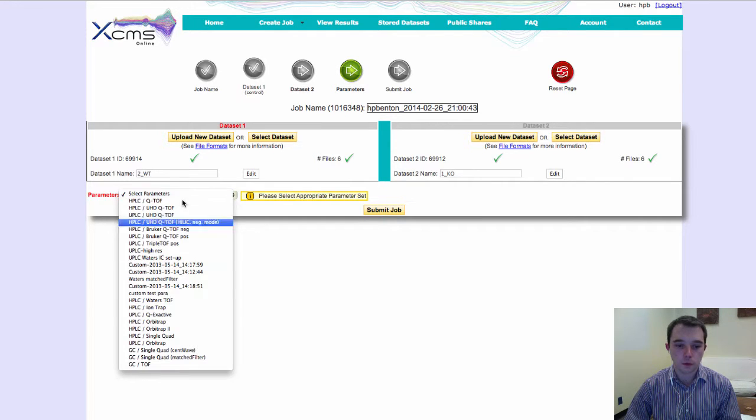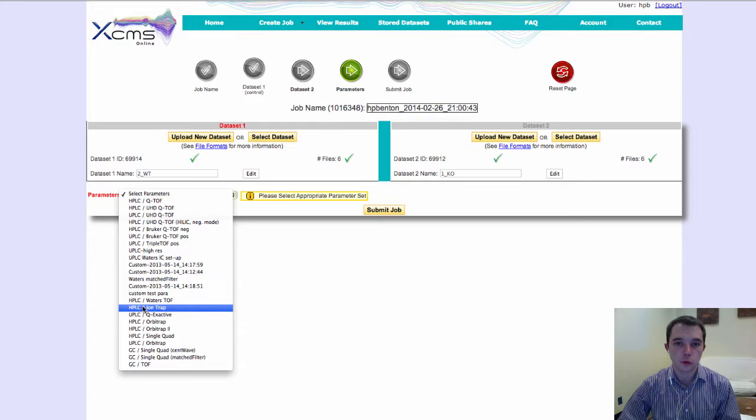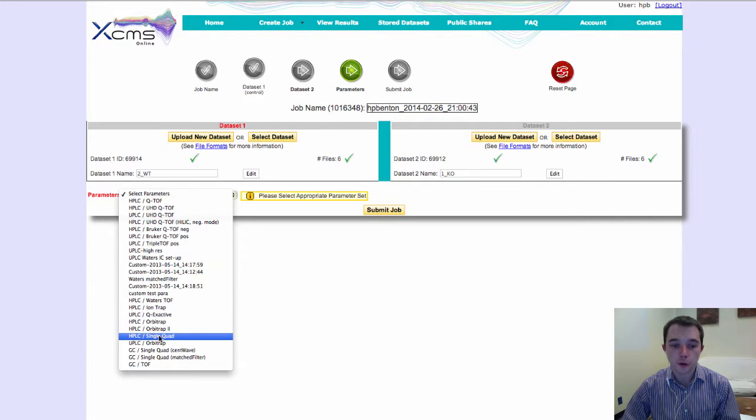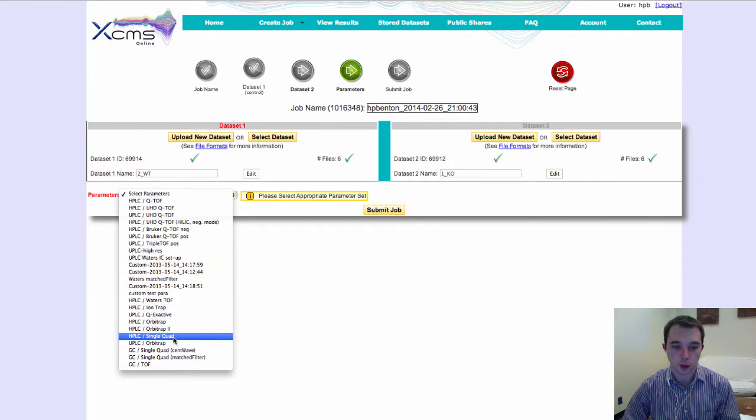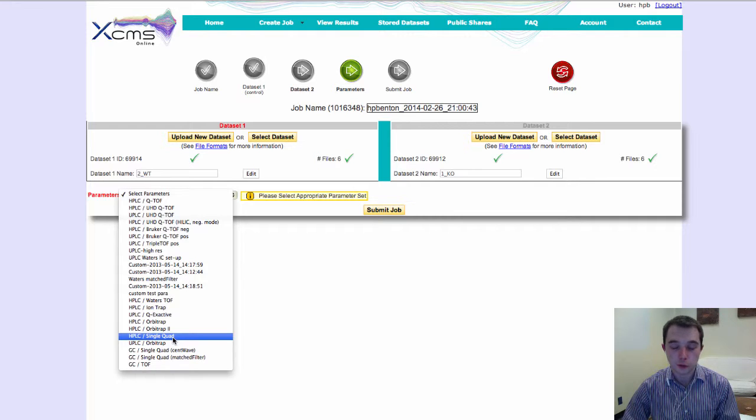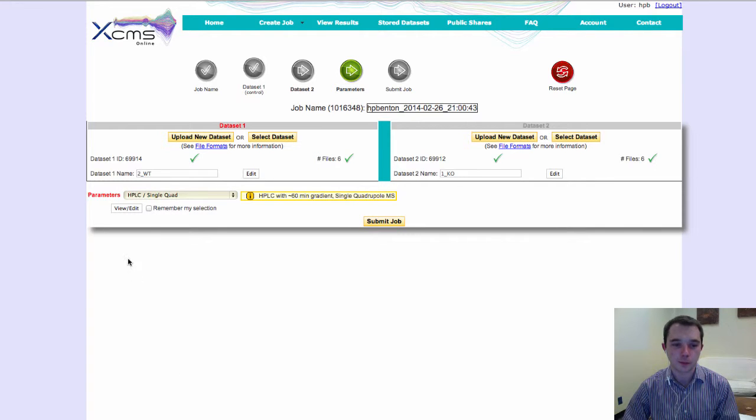And so we're going to just select the very best starting parameter settings for that. So this was run on HPLC, and it was actually run on a single quad, so that's the parameter setting that I'll select.